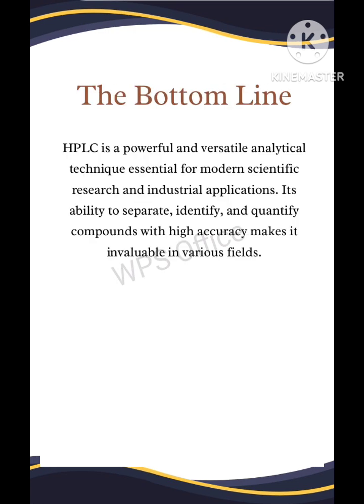The bottom line for this session is HPLC is a powerful and versatile analytical technique which is essential for modern scientific research and industrial application. Its ability to separate, identify, and quantify compounds with high accuracy makes it invaluable in various fields.